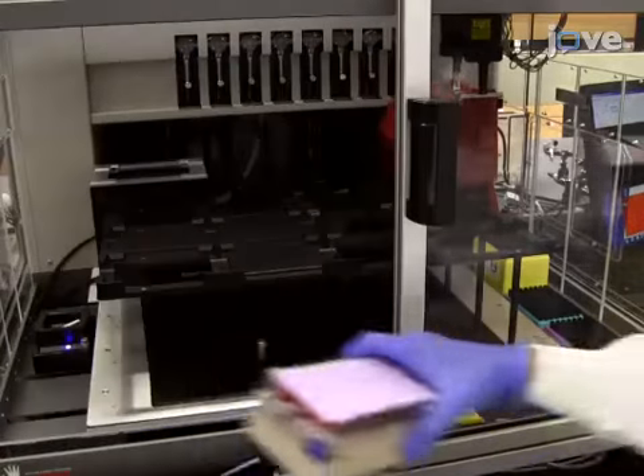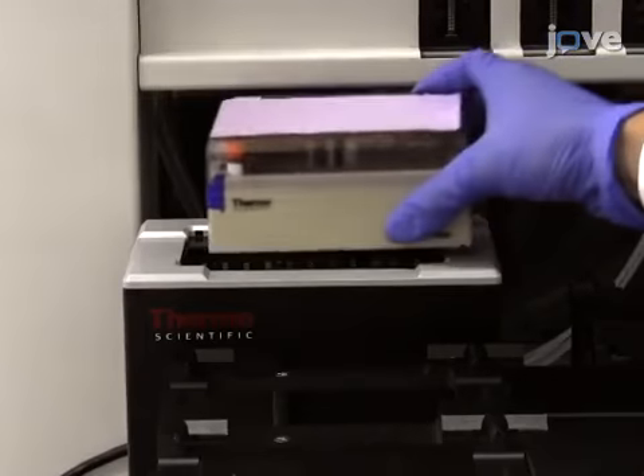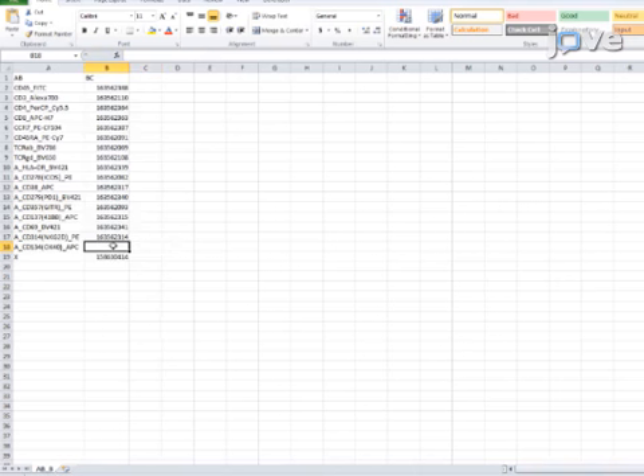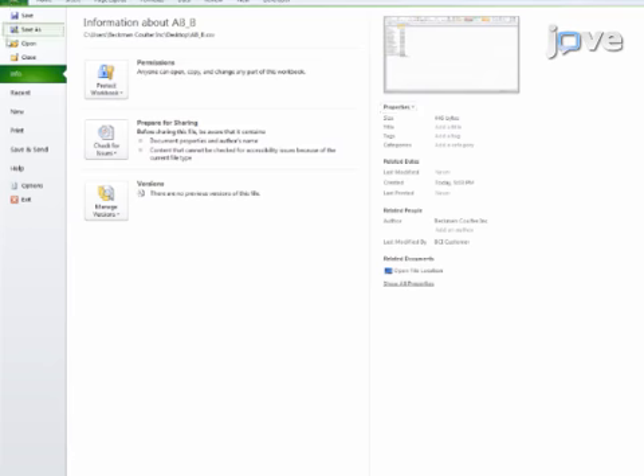When the antibodies have been transferred, use the 2D barcode reader to read the tubes. Then create a spreadsheet containing the antibody names and the barcode reads, and save the spreadsheet as a comma-separated values file.